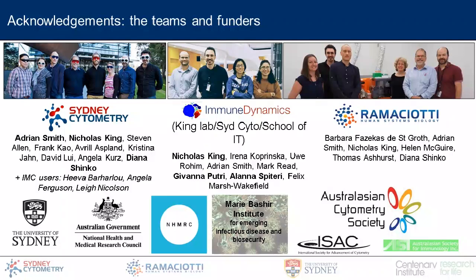We can do it a little bit differently, though. We can often do this on the same slide. For instance, we have some antibodies which are able to label fluorophores. So for IMC, for instance, we might have a metal label antibody that can label FITC.